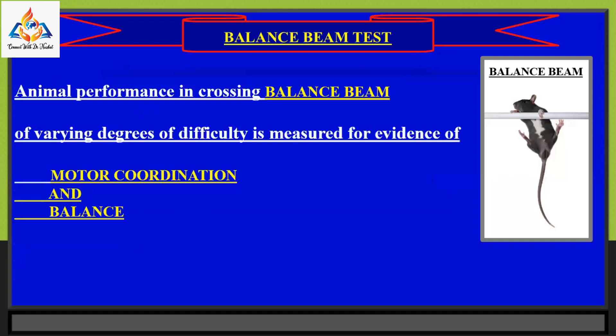The balance beam test is fairly easy: place the mouse at the starting end and encourage it to cross the beam to the other side. Researchers can then measure the latency to walk across or the number of foot slips. One commonly measured characteristic is the performance of the rodent's hind limbs. Animal performance in crossing balance beams of varying degrees of difficulty is measured for evidence of motor coordination and balance.